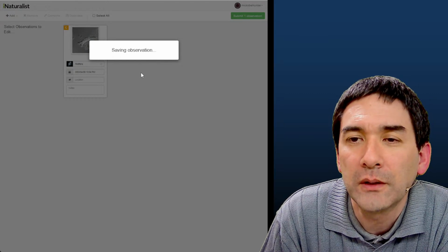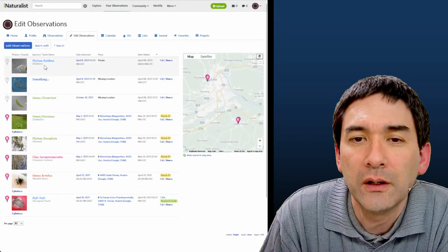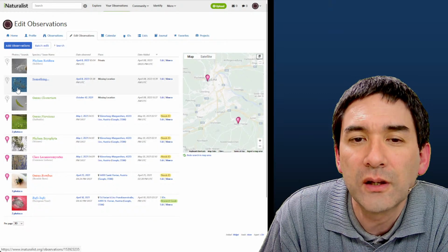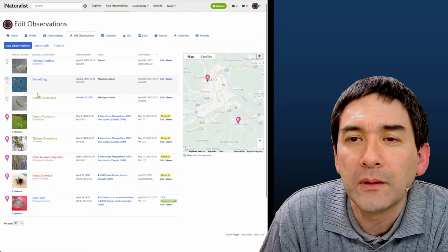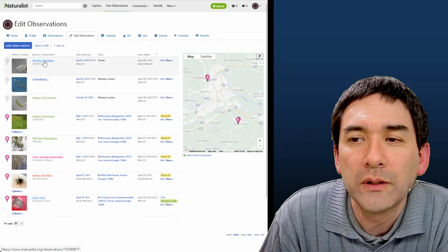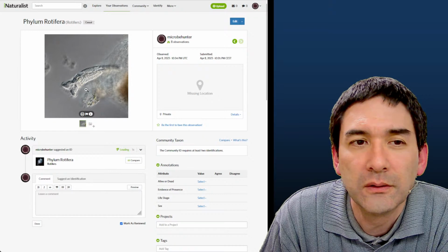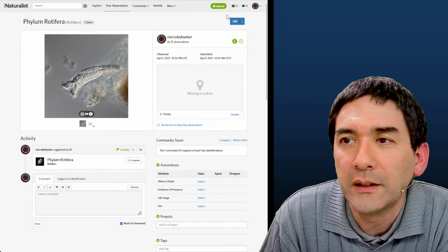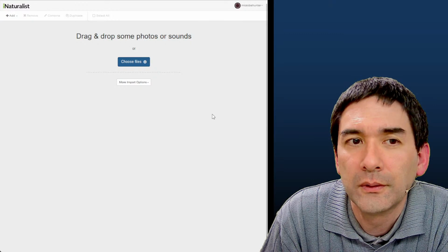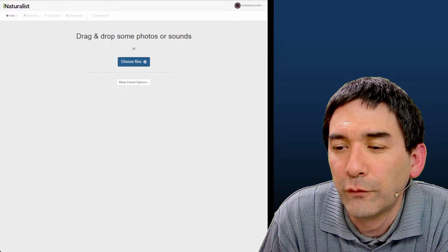So, saving it now. And here it is. And here you see basically what I've uploaded. You see over here this paramecium that I uploaded was not automatically recognized. But this one over here, that's the one that I've got here, was actually identified. You know what I'm going to do? I'm going to upload another one over here. Let me see. I've got here, let's see if it's able to identify the Vorticella.